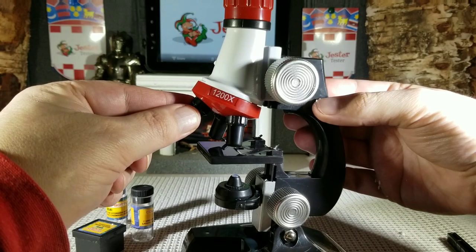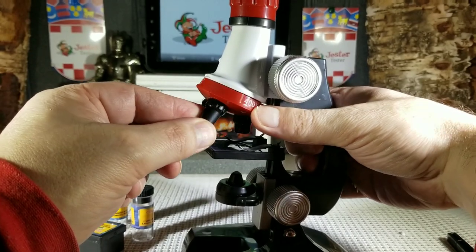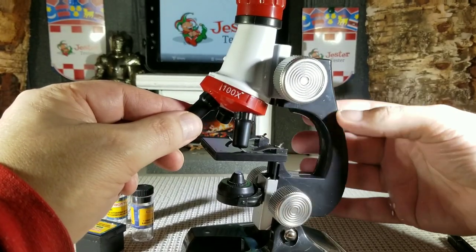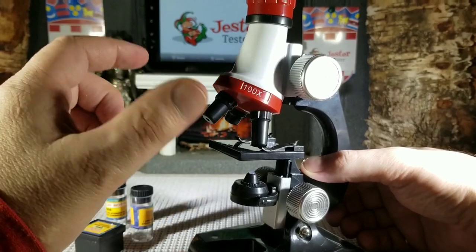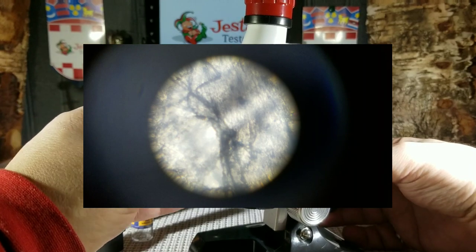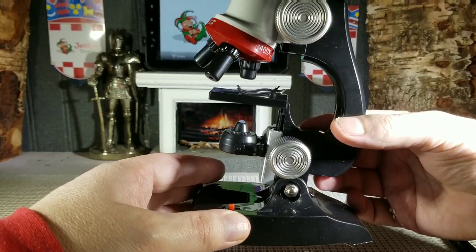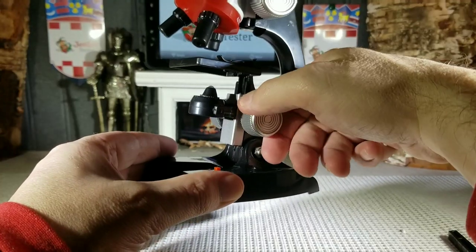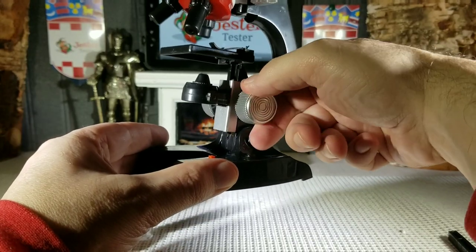At 1200 magnification, you can see it takes a really, really good picture. You get in really close and you can see the fibers very well. We also took a shot of a human nail and you can actually see the keratin fibers in it — that's how good the lens is. You have your stage with stage clips, just like a regular microscope. You also have a light control knob which brings your light up closer to your slides or further down, depending on how much illumination you want.